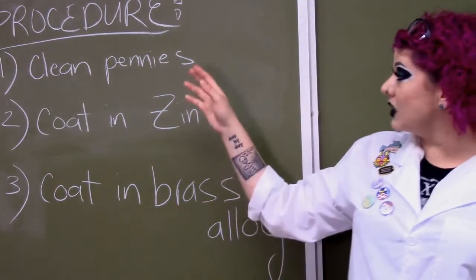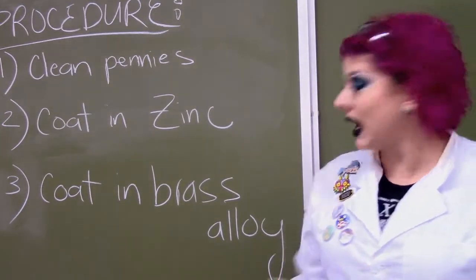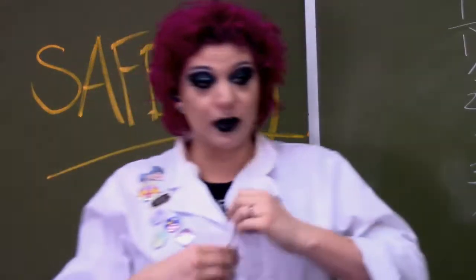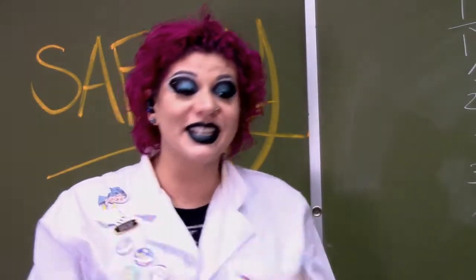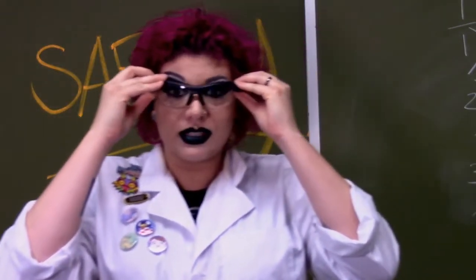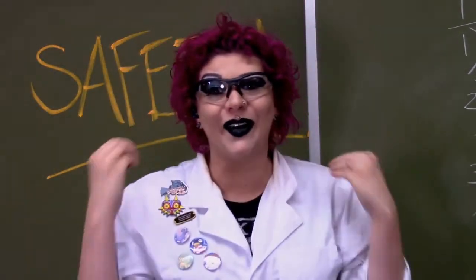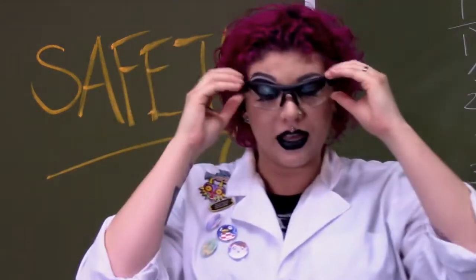First up, though, before I can do any of these protocols, I need to make sure that I am abiding by our safety protocols. All right, so I already have a protective layer on top, my lab coat. I also have my safety glasses that I'm not going to wear on the top of my head. I'm going to actually wear them like safety glasses. I know they look super cool. And then for my hair, y'all, I actually just trimmed my hair so I can't pull it all the way back. So instead, I have this headband that I'm just going to use to push my hair back.